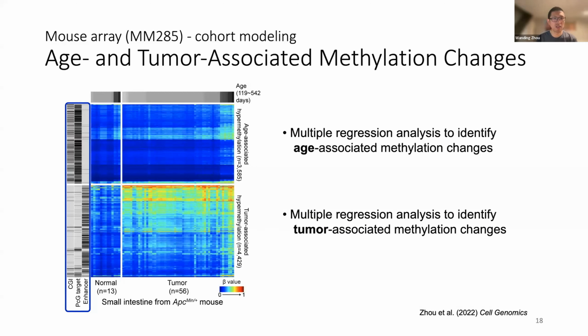In this case, we are looking at age and cancer, because cancer is considered an age-related disease, and both processes involve a lot of cell proliferation. And hence, it could be difficult to fully disentangle the two processes and the methylation changes coupled to them. So in this study, it's the same data sets. We look at dozens of samples with various age and oncogenic tumor status, malignant status.